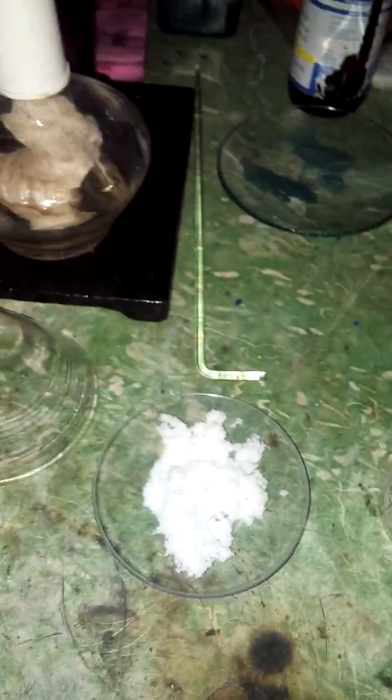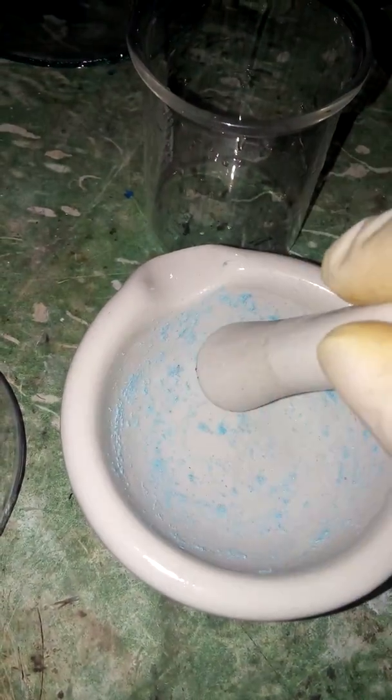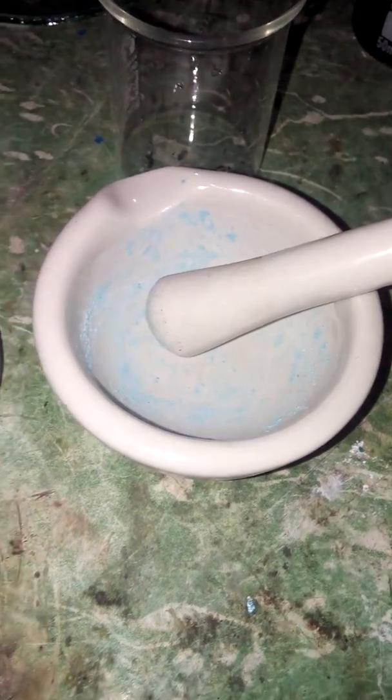First you want to take your mortar and pestle. There is some copper sulfate already in mine, but that's not gonna be a problem because we are gonna be crushing copper sulfate in it. Open up the copper sulfate bottle and take some out to crush it up.